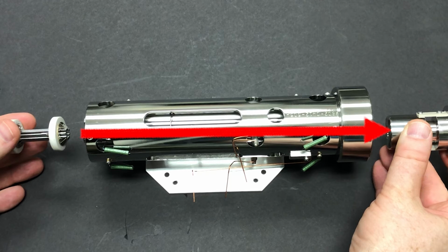Okay? Now, these quadrupolar fields are solved by a relatively complex set of equations called the Mathieu equations. We are not going to solve these equations, but we are going to look at some plots for solutions of these Mathieu equations. Now, because they're telling us whether an ion is stable or not, we call it a stability diagram. And remember, if an ion is stable in a quadrupolar field, then it can fly through the quadrupole and hit the detector. If it is unstable, then it flies out and is not detected.